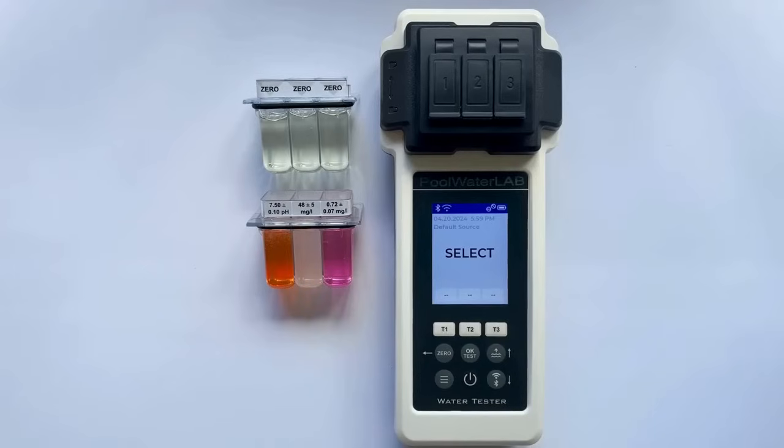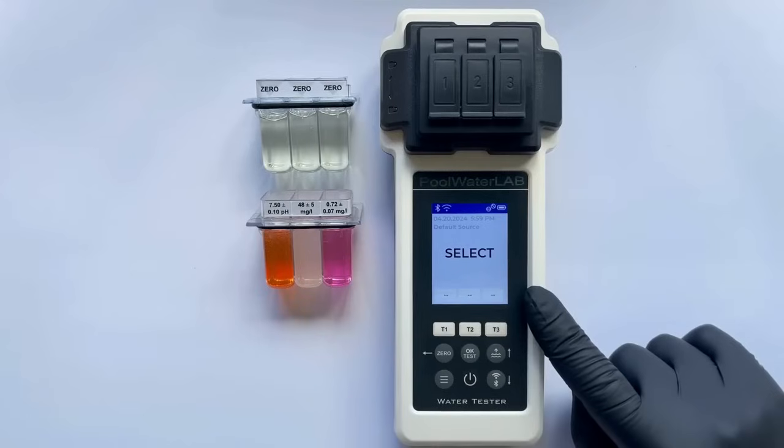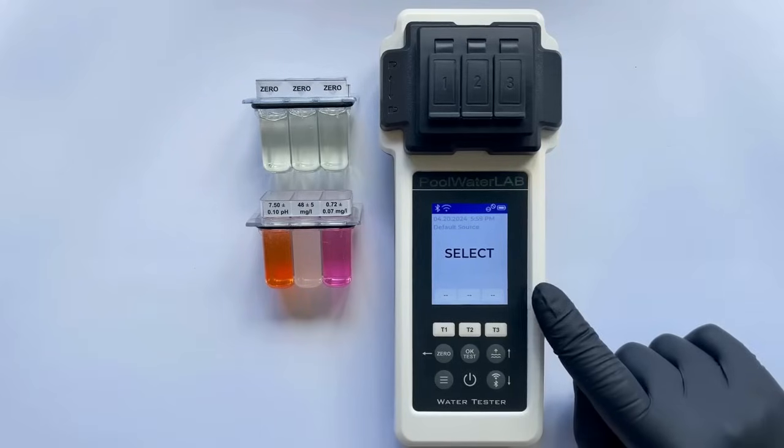The Pool Water Lab Tester is rated at the L1 accuracy level, which is the highest standard of precision recognized in the USA. This rating ensures that the tester adheres to stringent guidelines for accuracy, providing users with reliable and consistent measurements for water quality testing. We explain this distinction to help users avoid making inappropriate comparisons, akin to comparing apples to oranges.